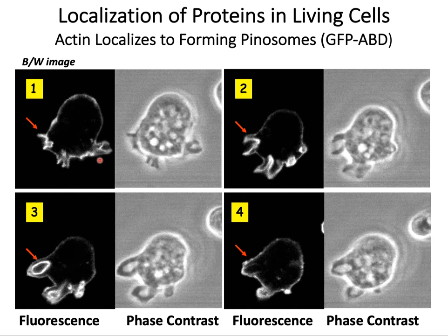In the fluorescence image, the actin is lit up and generally around the periphery of the cell. The main interest was the role of actin in endocytosis, which is a process by which cells take up particles from extracellular space and do it by forming vesicles from the plasma membrane and pinching the vesicle off so they end up in the cytoplasm. So this is a cell undergoing active endocytosis.